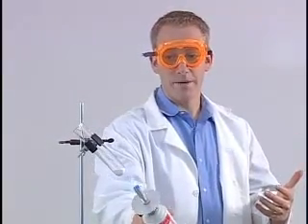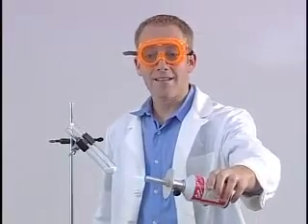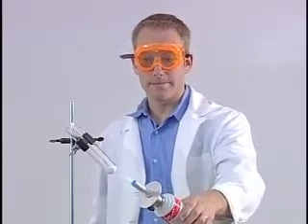Hi. What I'm going to show you here is a demonstration on how we convert the bond energy that's inside a glucose molecule into a different form of energy. In this case, I'm going to convert it into heat energy, which you won't be able to see, obviously, because you can only feel heat energy or thermal energy, and light energy, which you will be able to see.